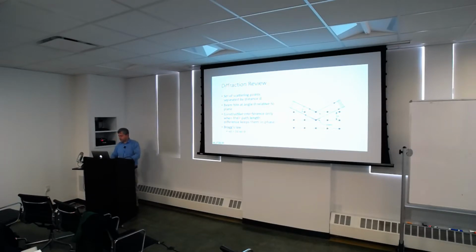From Bragg's law, if they're separated by a distance d and it's scattering at an angle essentially 2 theta, the wavelength of the incoming beam, lambda, has to be some multiple equal to 2d sine theta. So the basic equation is n lambda equals 2d sine theta, and that defines where the diffraction spots will appear. This is how X-ray diffraction works.